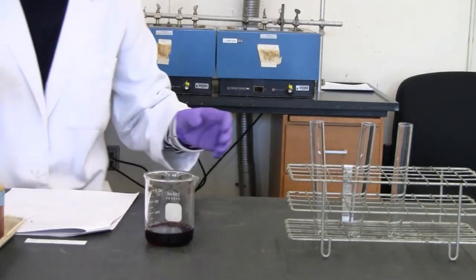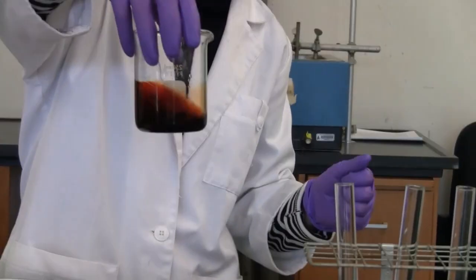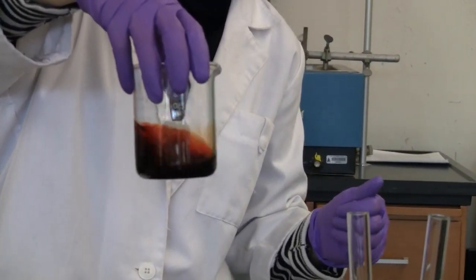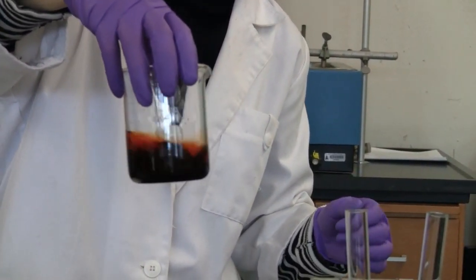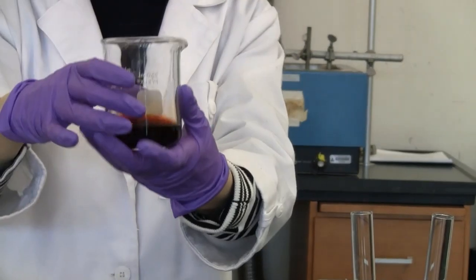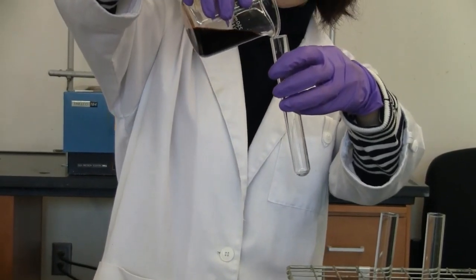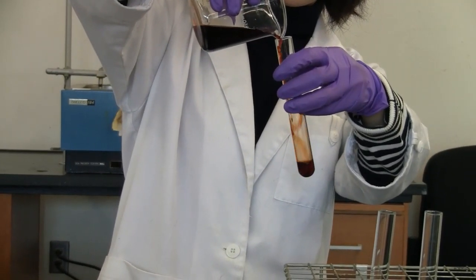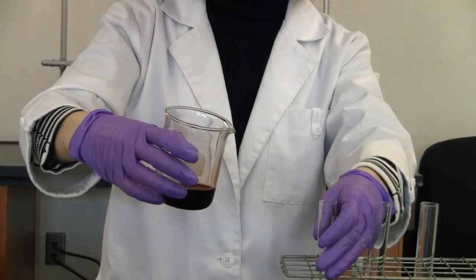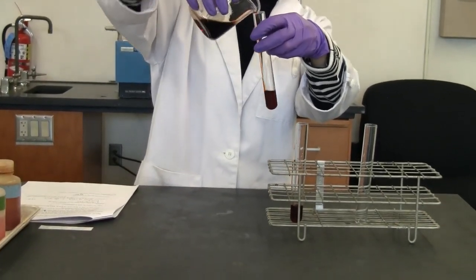So this is going to be our stock solution. You can see the solutions. This is pretty much the 2 reactants mixed in the equilibrium equation. Okay, so I'm going to split this into 3 test tubes, about 5 milliliter in each.